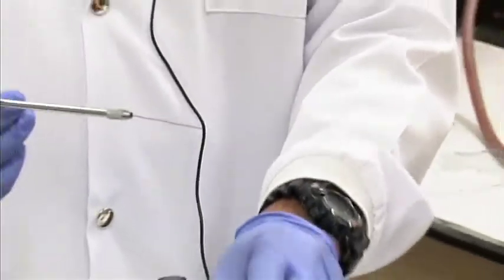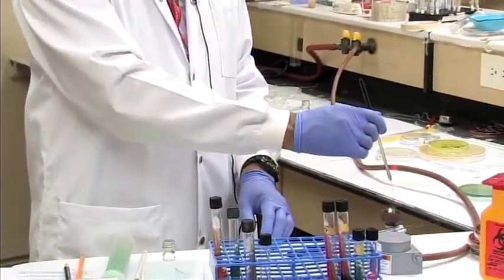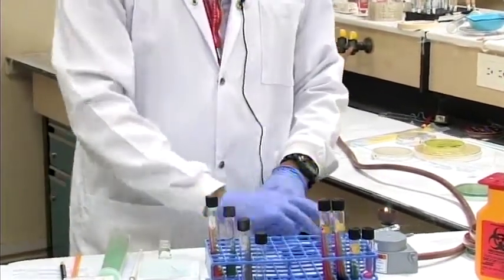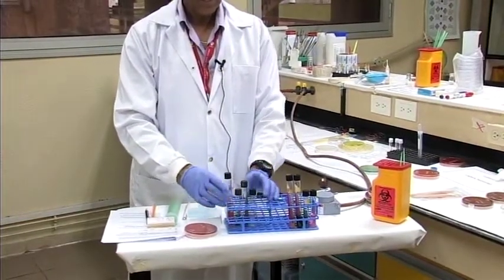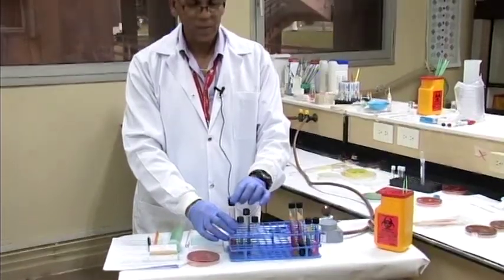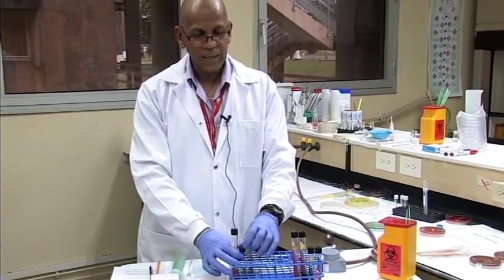And so we go on inoculating your different biochemical tubes, whether it's a stab or streak or both of them. After we have inoculated, you want to take all your biochemical tubes. The very important one you must leave slack for air to pass through is your TSIA. So make sure it's not covered tightly. There must be a space for air exchange. The others can be tight.